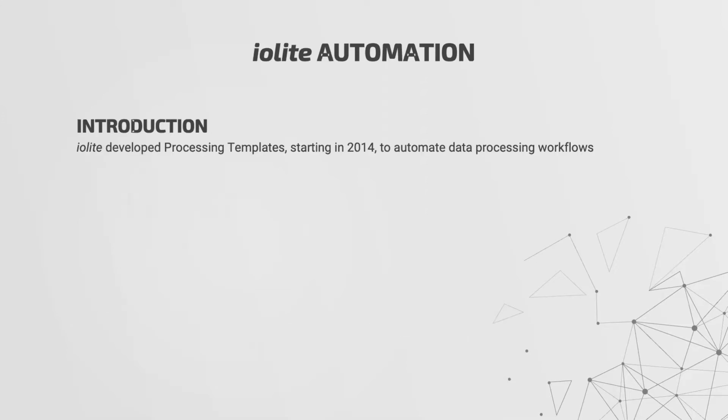Just as an introduction, iolite has had processing templates for ages, but we don't get a lot of questions about it, which suggests to me that there's not that many people using it, because normally if there's a lot of people using it, we get a lot of questions.